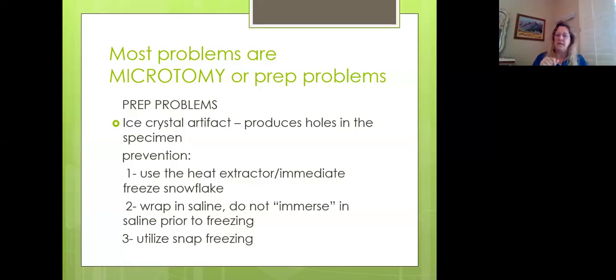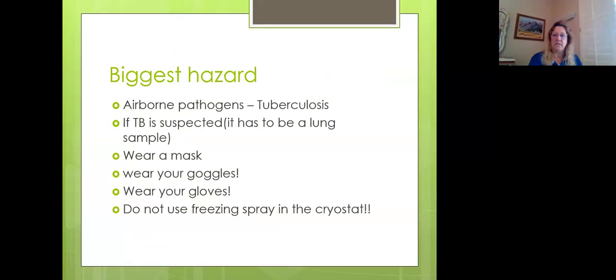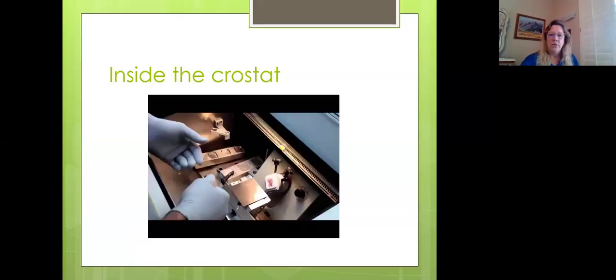If you hit that, that snowflake is going to drop the temperature of your freezing bar over here so that your specimen will freeze much faster than -20. -20 is what the cryostat is always set on. And this will drop it significantly, down to -36 immediately.